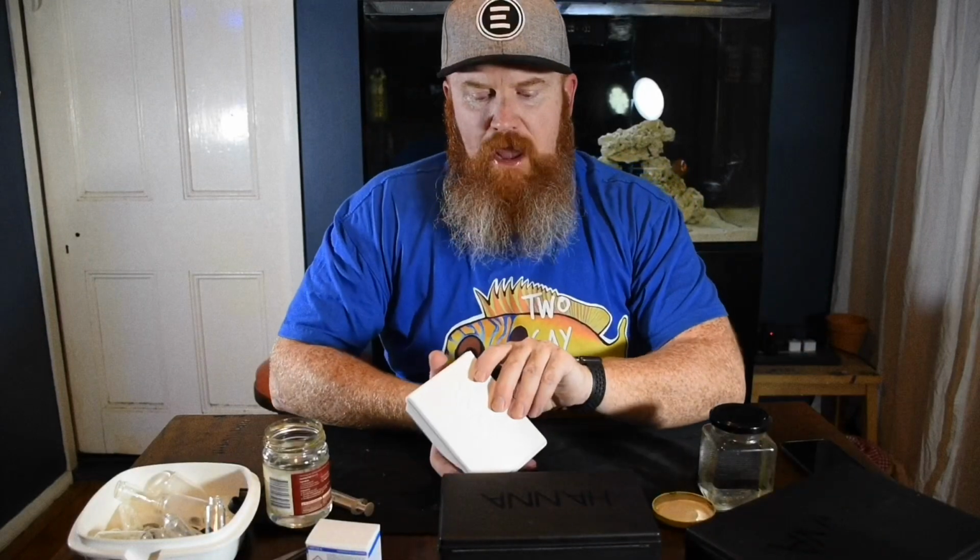Now we're on to the Hanna checkers. So we currently use the Hanna checker for our phosphate, this one here. We use it for our alkalinity and our calcium. If you haven't used Hanna checkers before, I really do like these things. They do work really well. They do run on batteries, which means you do have to always be replacing the batteries.